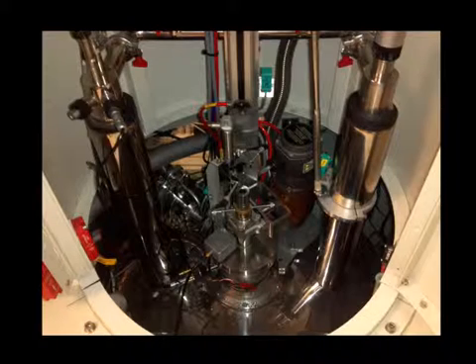So this is this stick here. This is the dissolution stick that we mentioned. It has the tubes that go in and out to carry the solvent down and then carry it out to the sample. Of course, here's the bore and the big magnet here, and down here is where the DNP process is happening.